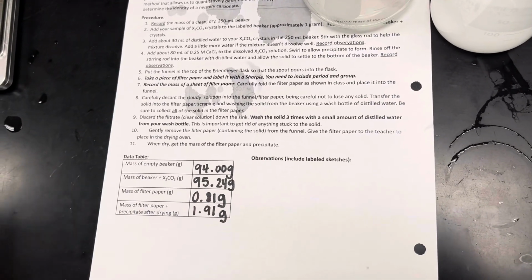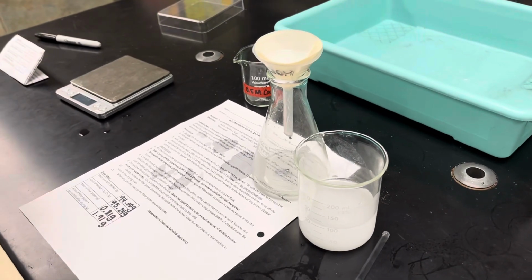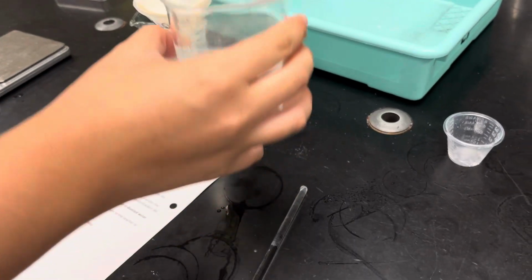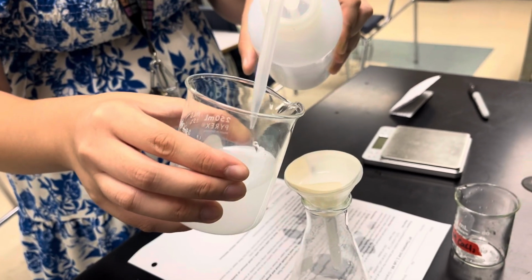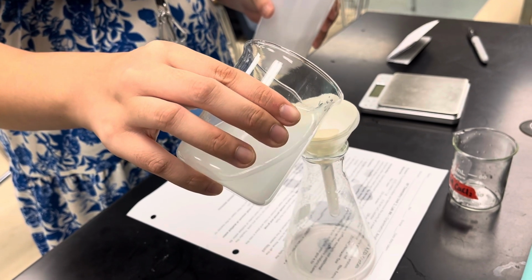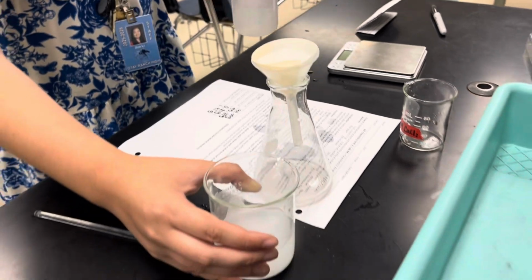A couple things you have to know about this lab that you kind of can't see because it's in a video is you need to make sure that all of the precipitate actually makes it into the funnel. So a common mistake people make is they accidentally leave some on the sides of the beaker. There's a lot of cloudy stuff on the beaker. You need to do your very best to wash it as well as you can so that there's nothing cloudy on the beaker. And then make sure all of it gets into the funnel. Otherwise, you're losing some in the beaker, right?